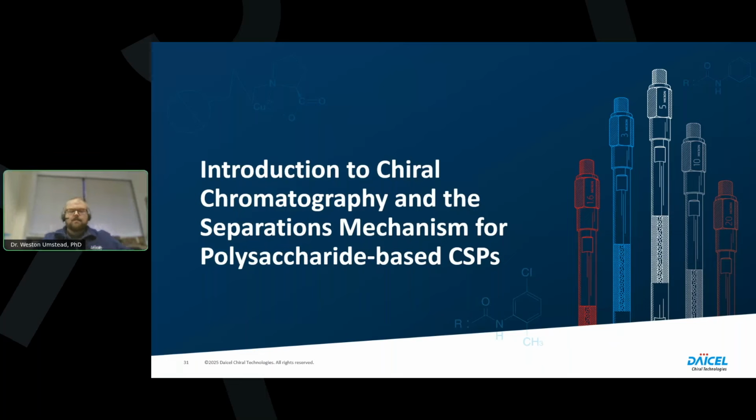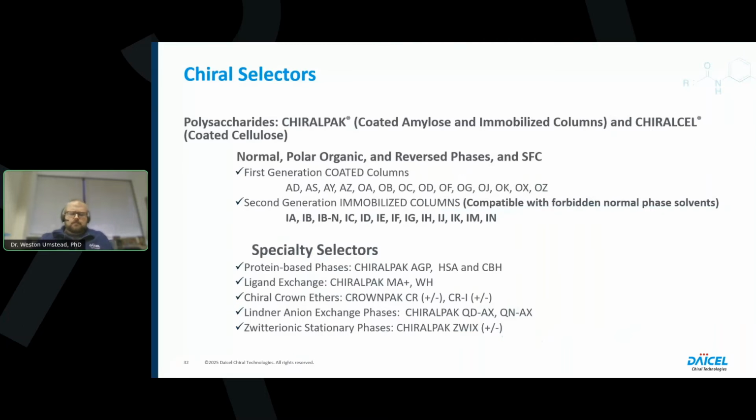But let's jump in now and start really drilling down with the polysaccharides, because as I mentioned, Daicel Chiral Technologies, Daicel Corporation, these are the phases that we are most well known for. They are the ones that are the most widely used across the broadest diverse landscape of chiral molecules. So it's worth doing a bit of a deep dive into these and discussing the separation mechanism. So that's what we'll do, but first, we'll start with the naming.